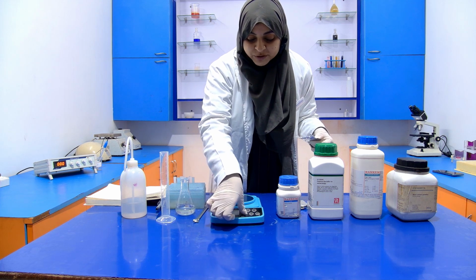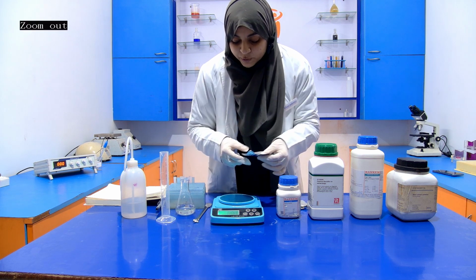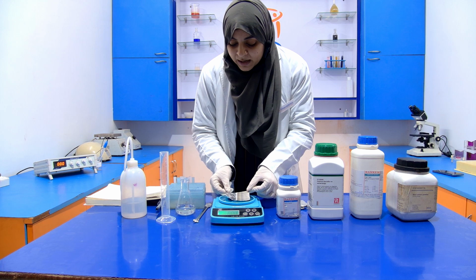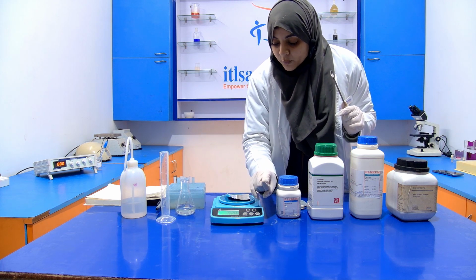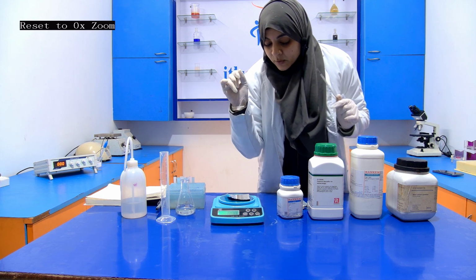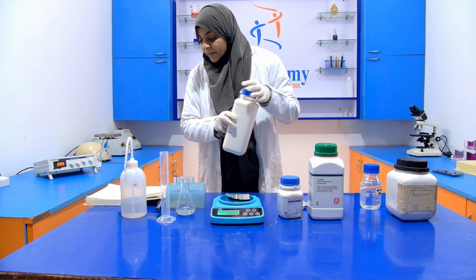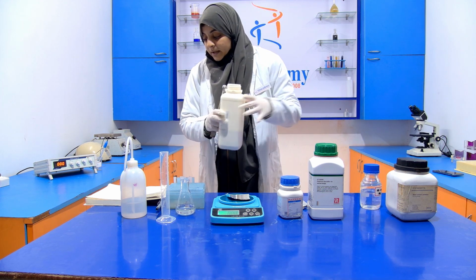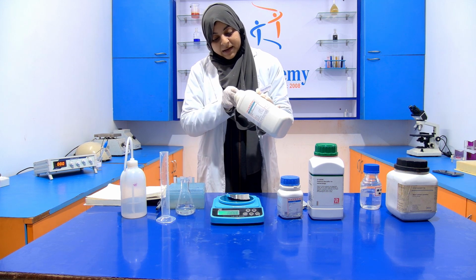Now first of all, I am going to take a weight of agar. So I am going to switch on the weighing balance. You can see that it is 0. Now I am going to put an aluminum foil on it. When the weight is there, then you have to tare it. Okay, now it will be 0. Now for the 100 ml of distilled water, the agar required is around 1.5 gram.